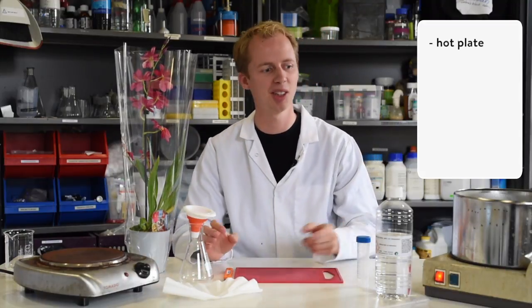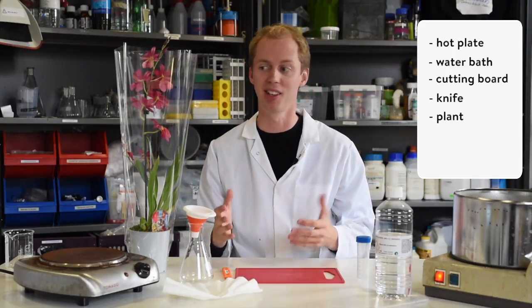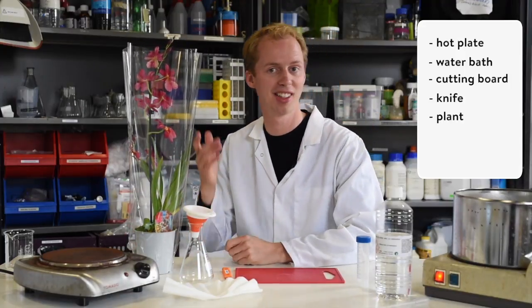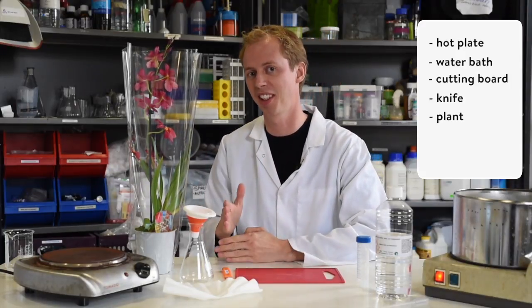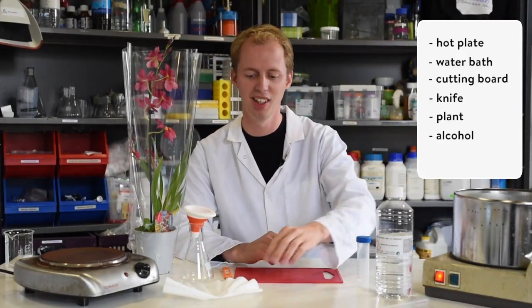You need a couple of things. First of all, some equipment: a hot plate, a water bath, and a cutting board with a knife. Of course you also need a plant — this is an orchid, a red one from the market. I chose it because it has a lot of flowers and it's blossoming. Next, we also need alcohol to do the extraction and a filter.